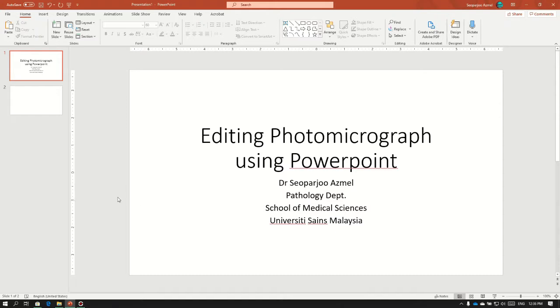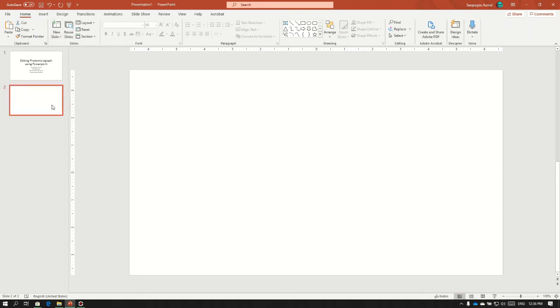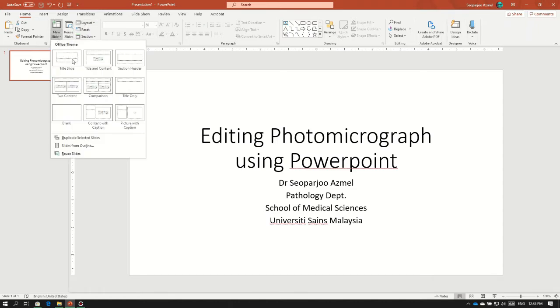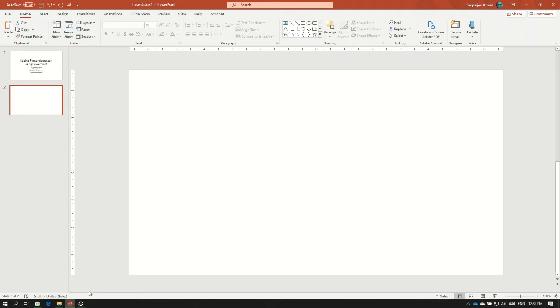Before we start, I would like to highlight that I'm using the Office 365 version of Microsoft PowerPoint. If you are trying to use it, you should use the latest version of Microsoft PowerPoint from Office 365.